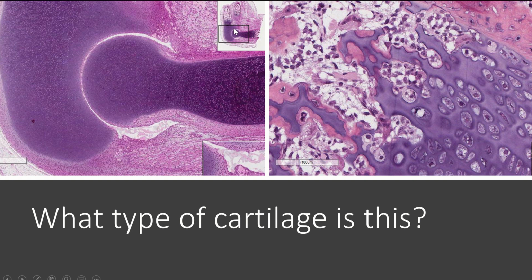Okay, so it's a little humerus and then a little ulna kind of forming here. They're still forming because this is the fetus, right? And remember we said that hyaline cartilage is the blueprint for bone. So this is going to eventually be a full-blown humerus, a full-blown ulna. It's just not converted into bone yet. So the majority of it is hyaline cartilage.